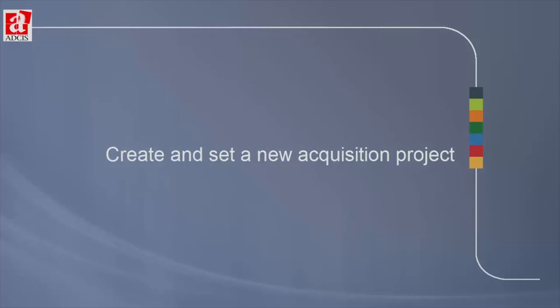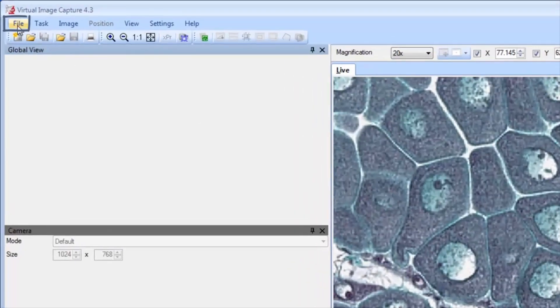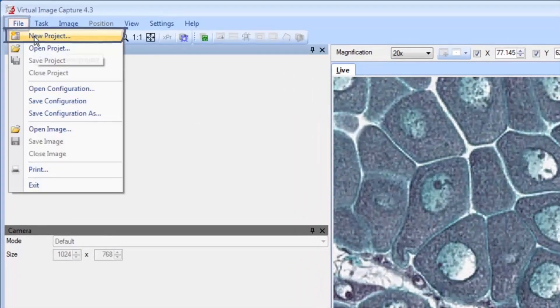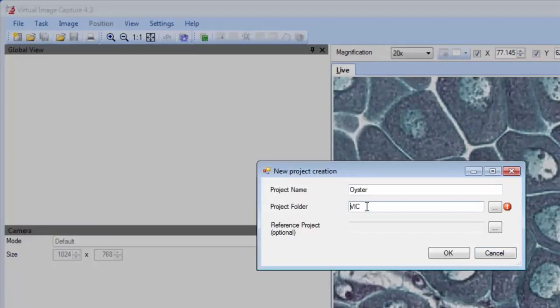Let's create a new acquisition project by first clicking on New Project in the File menu, then entering a project name and a project folder in which the images will be saved.